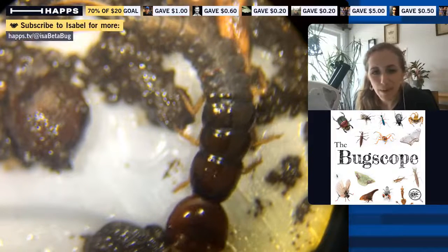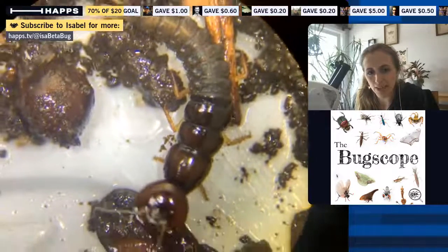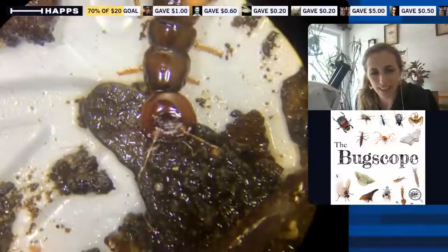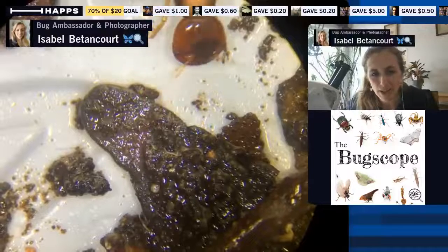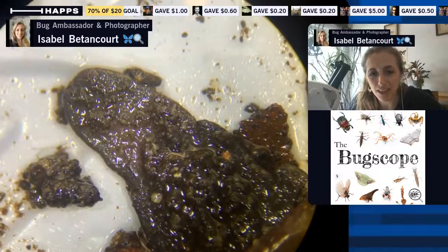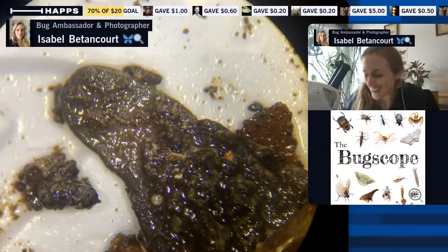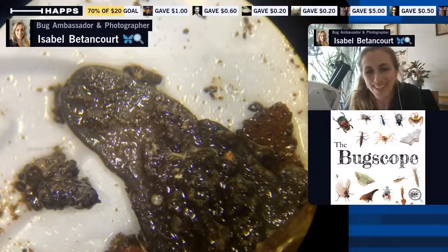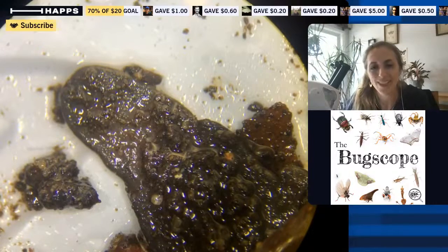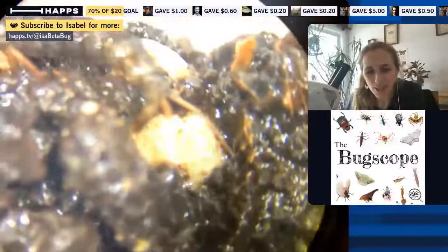So this is a baby beetle — probably a predacious one. I don't know the species yet and I'll keep you guys posted. If you're not familiar with the beetle group, there are 400,000 species of beetles in the world, so I do not know them all — and even beetle experts don't know them all. We must divide and conquer. That's why it's so important to have many different taxonomists — people who study the tree of life — to understand beetles and know what is what.